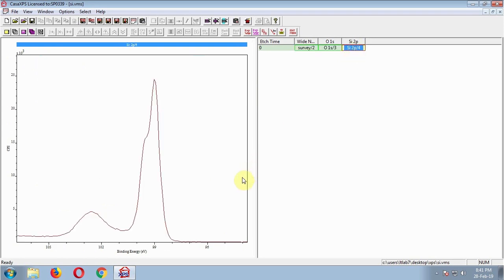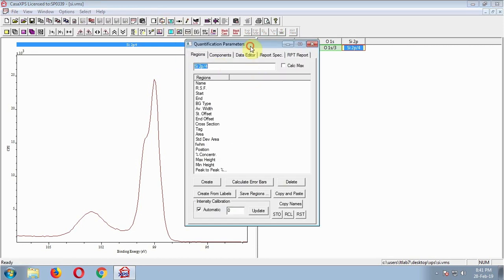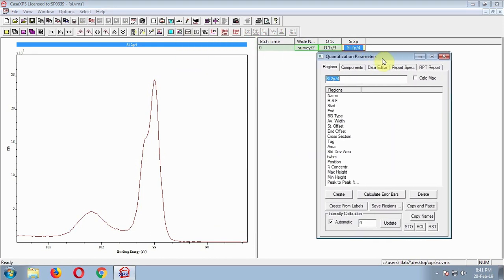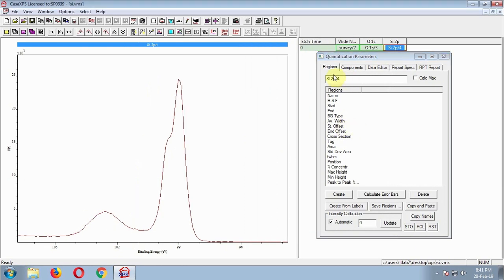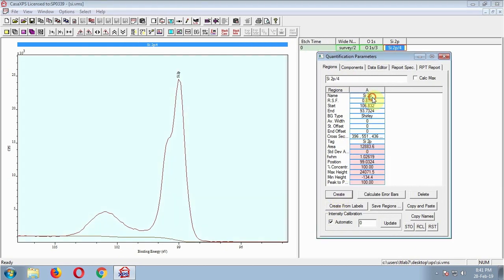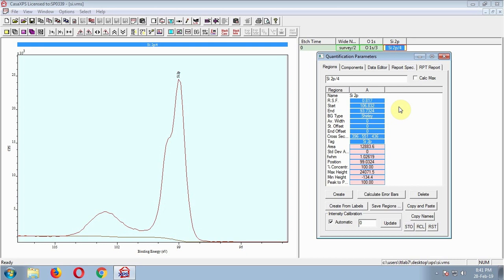This is the Silicon 2P narrow scan. If you can remember, in the previous video I have shown about Silicon 2P — identification, smoothening or noise reduction, basic fitting, etc. Now let's begin the fitting. Create a region: Si2P.